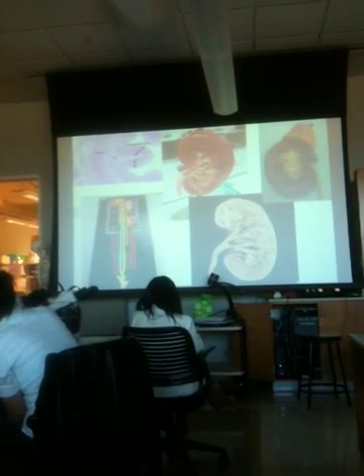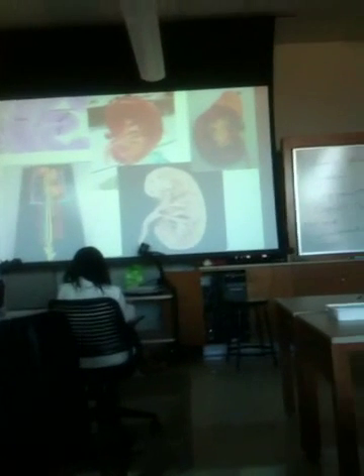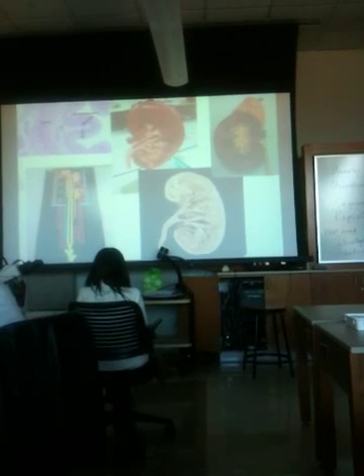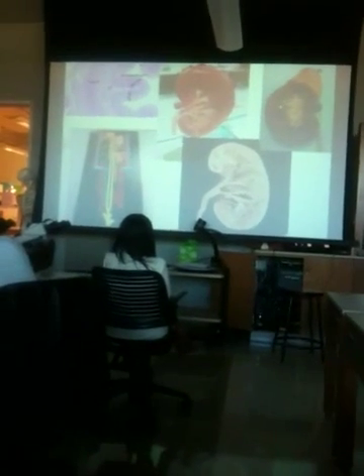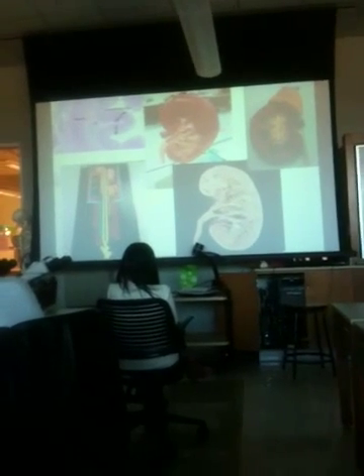Okay, so here is a look at a cut kidney. Remember we looked at pig kidneys. What are these regions right here? There's one right there. It's a pyramid. You can see a pyramid here. You can see a pyramid here. The pyramids are in what area of a kidney? The medulla. So it's all medulla.